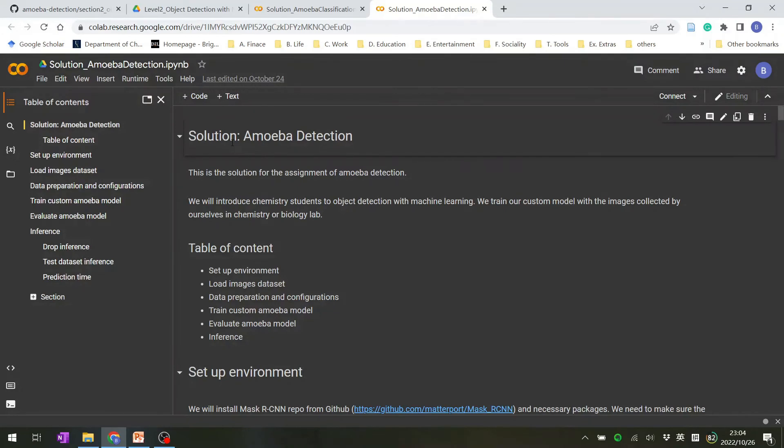So here is how it looks for the solution notebook about the amoeba detection.